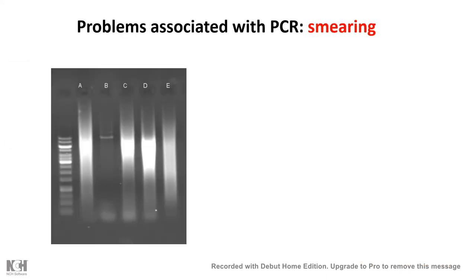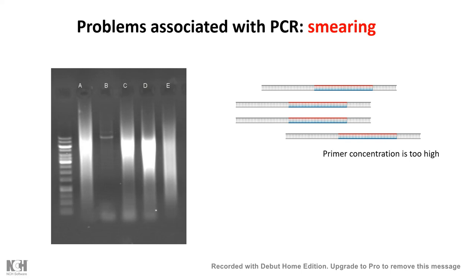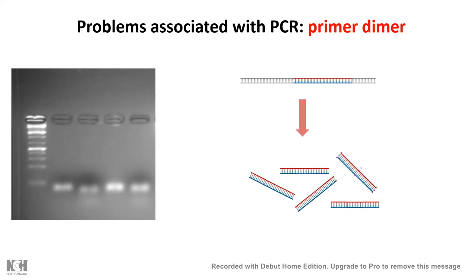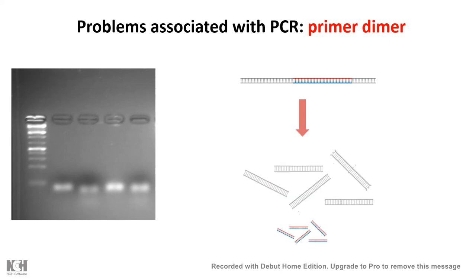There could also be a problem with template concentration — if the template concentration is too high, it can cause smearing. Another problem is primer dimers: if the primers are too self-complementary, instead of annealing with the DNA template they anneal with each other, so instead of amplifying the gene region of interest, only primer dimers form. These are several problems associated with PCR, but with optimization, multiple adjustments, and proper primer design, all these problems can be solved.